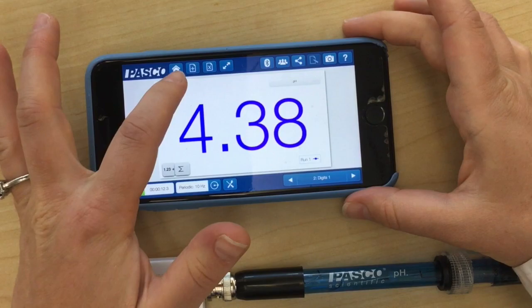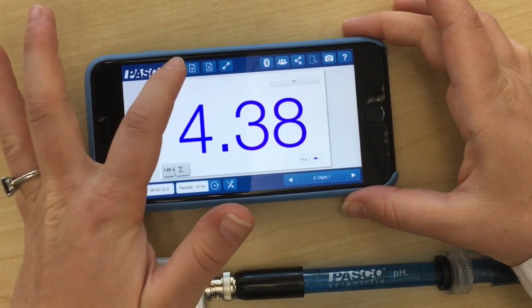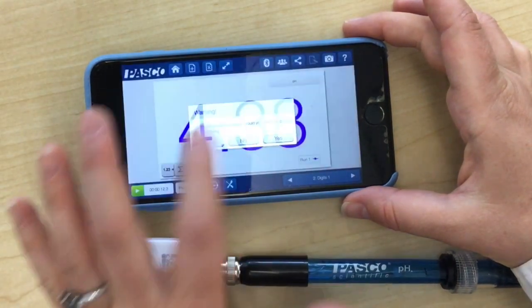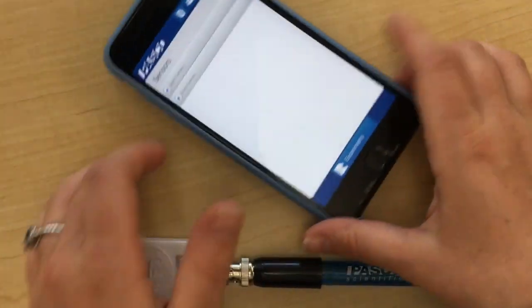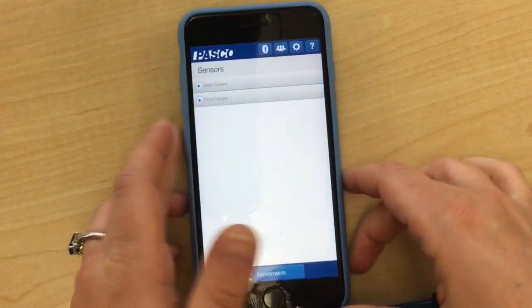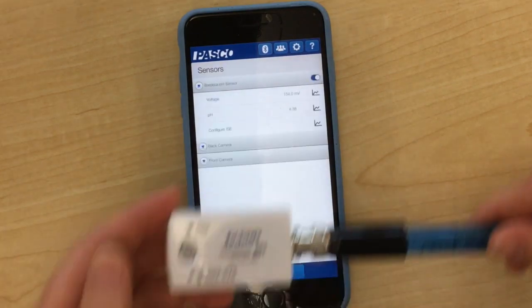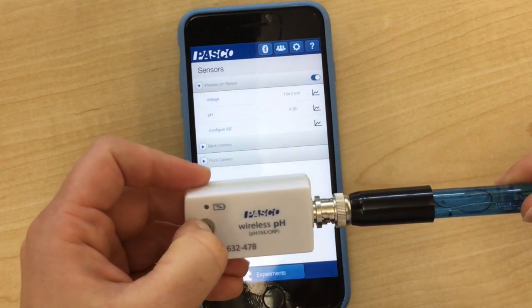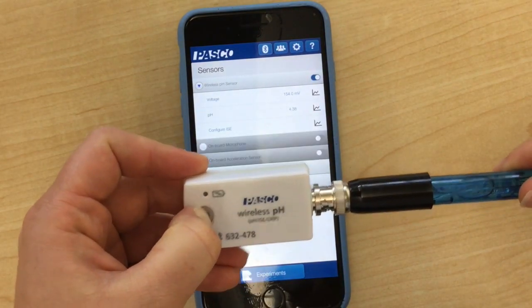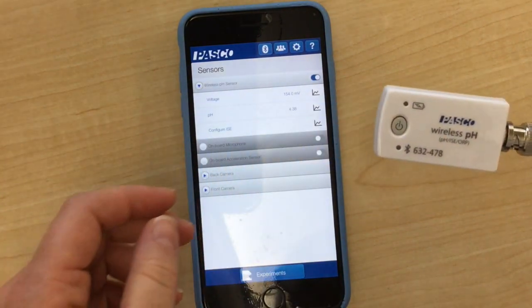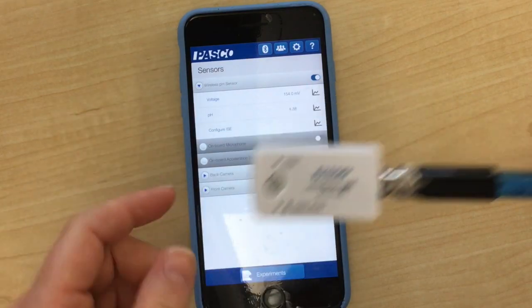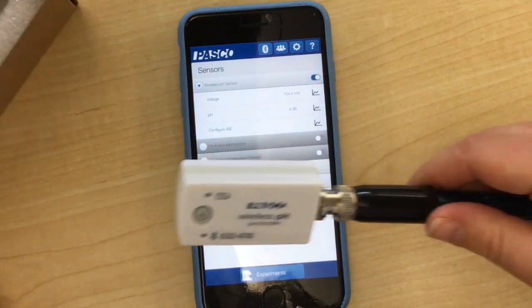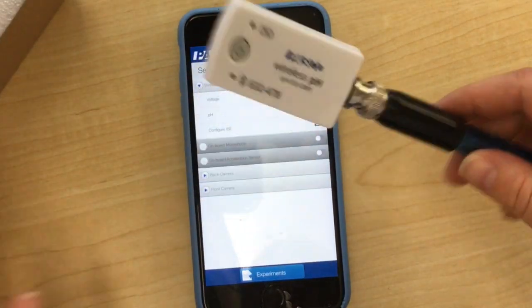When you're all finished, you can go to the home button. You can say no you don't want to save it, unless you do. If you turn yours off, hold the button and it will disconnect your probeware, and you can put it back into the box.